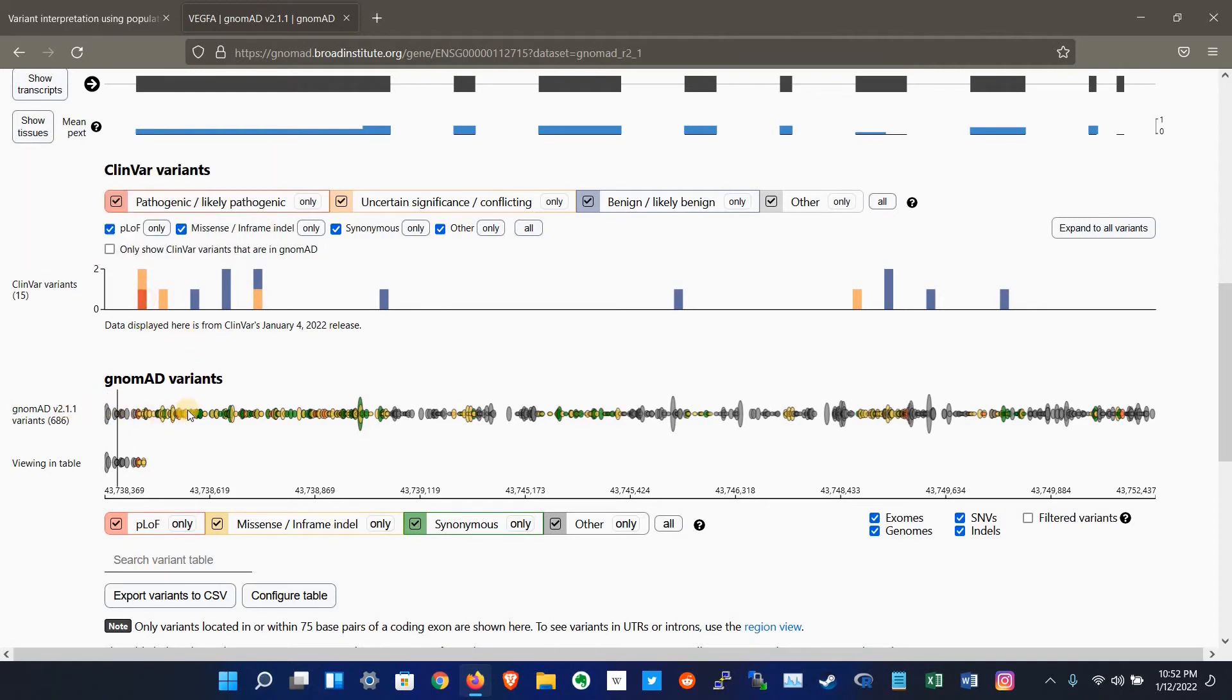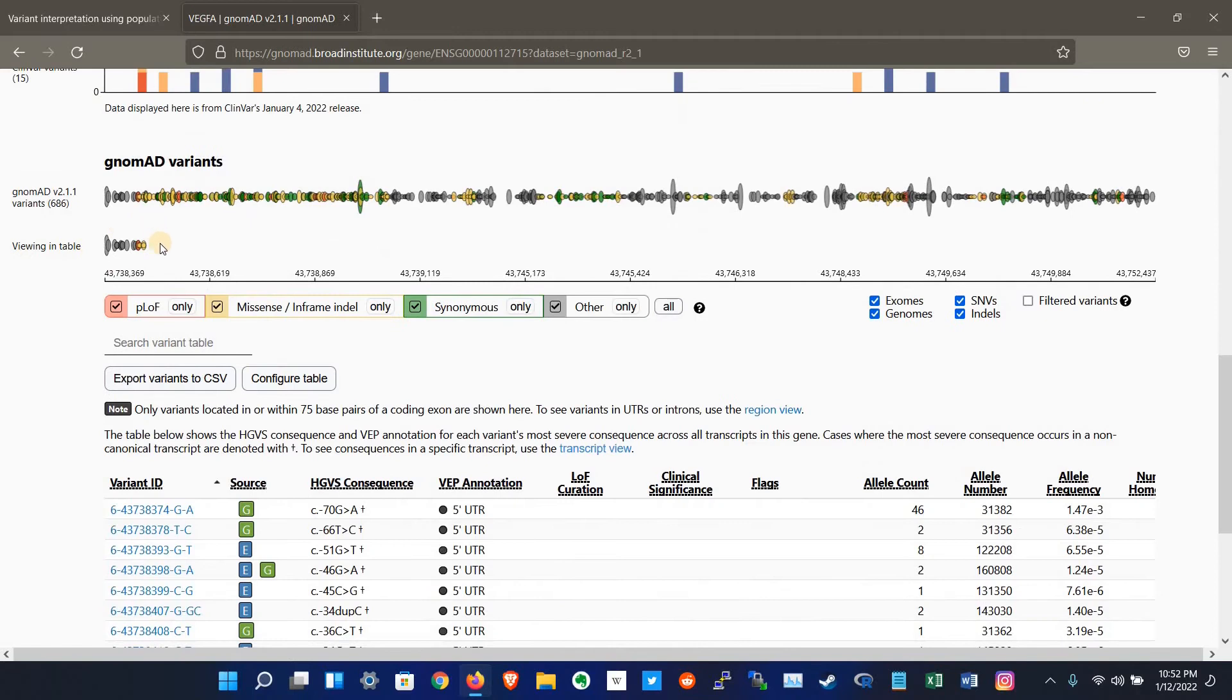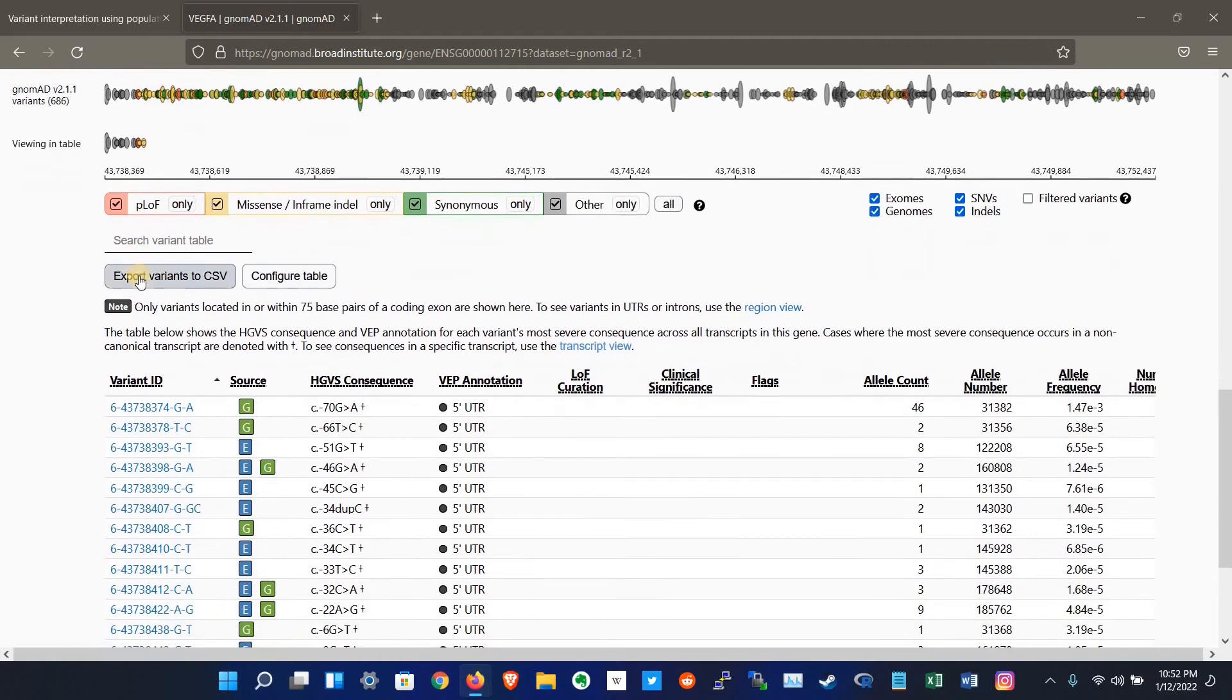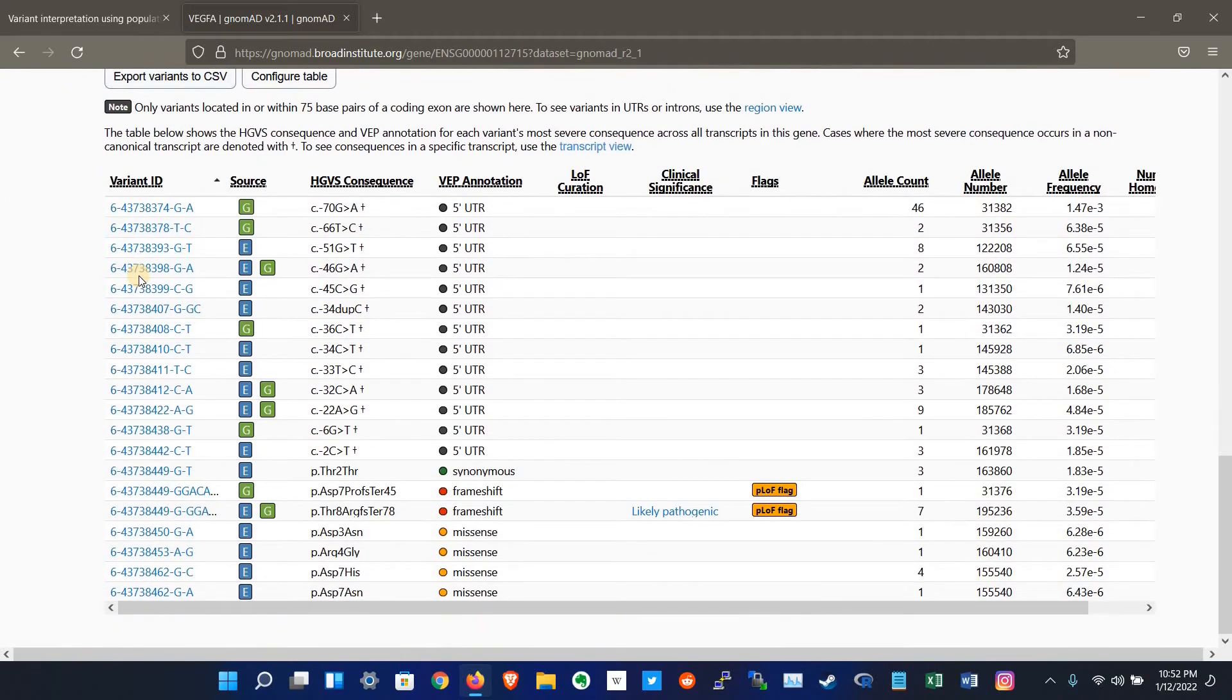These are the variants on the gnomAD database, and here are the variants which are shown in the table below. Here are the variants of this gene.